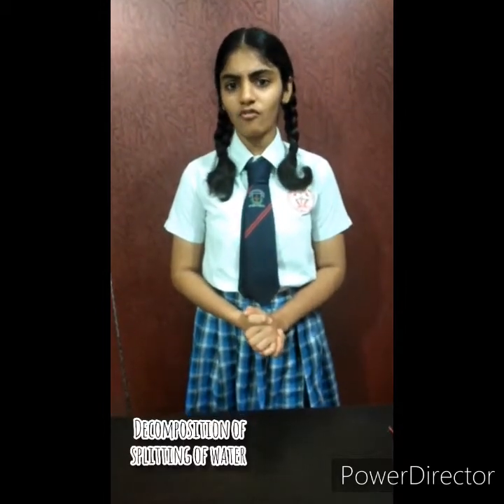Joseph School. Today I'm going to do a model on electrolysis of water. Water has been one of the most important components in our life, be it for day-to-day life activity or for the survival of living organisms. So I'm going to do a model where I'm going to produce two gases, hydrogen and oxygen, by the splitting of water. The decomposition or splitting of water is known as electrolysis. So let's start the activity.